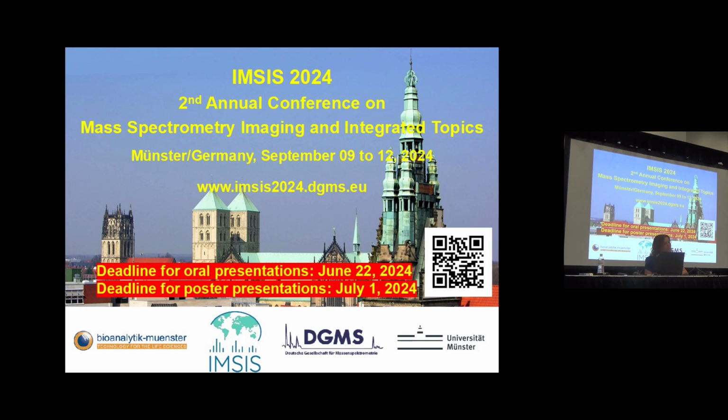So kind of following up on that question, could you adjust the thickness of the tissue to have higher lateral resolution? How would you adjust your method so that you can have higher resolution? Oh, we certainly can have higher resolution. As Jill indicated, this source can go down to 5 microns. My issue in this case was that, with as much as we were trying to dig in and accumulate, and the speed of the Orbitrap, these 3 tissues each took 32 hours to run.